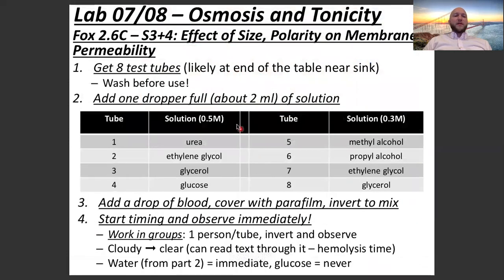Next up, we have Fox 2.6C S3 plus 4. So we're going to be looking at membrane permeability in this one. So we're going to have 8 test tubes total, washed and cleaned beforehand.